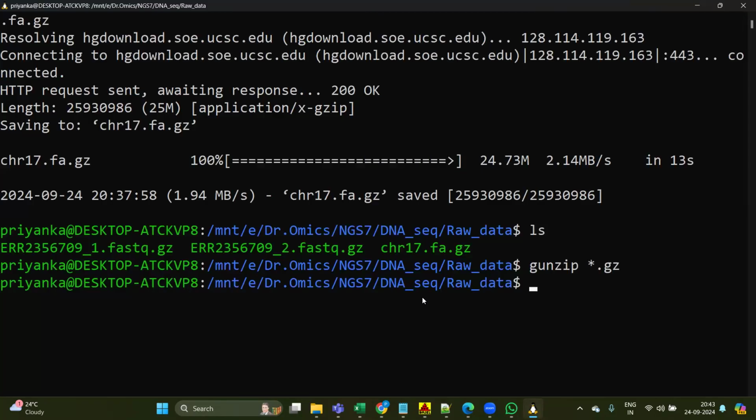Okay, my extraction part is done. Let me know from your side also.